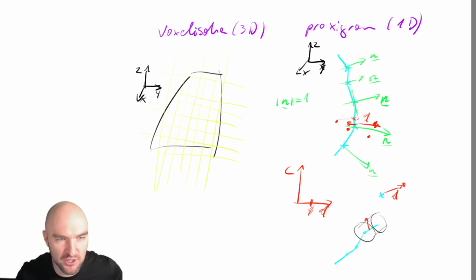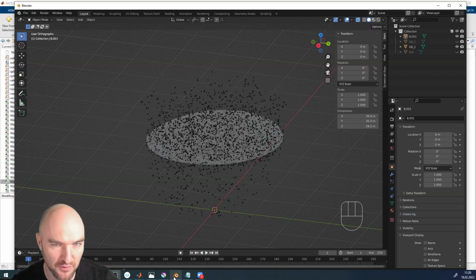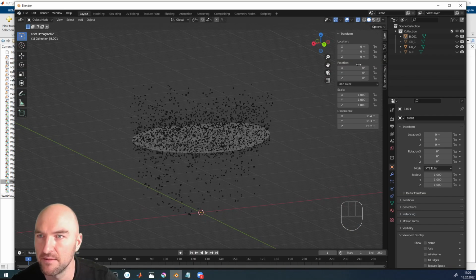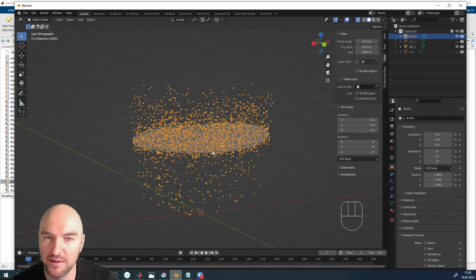Well, let's jump into Blender and look at whether I can see the surface normal. Actually, you can visualize it in MATLAB as well, but usually I just do it in Blender. In MATLAB, you need to calculate the surface normal and then display it as a vector. I don't do it that often. In Blender, it's much easier. So where we have our grain boundary 2, and if I go into view, I need to select the grain boundary.